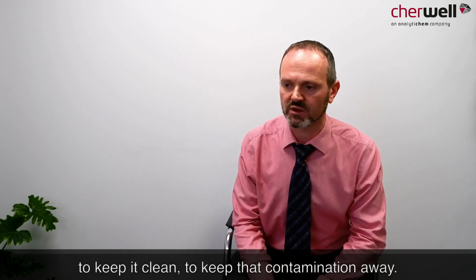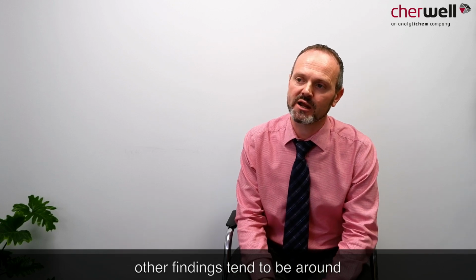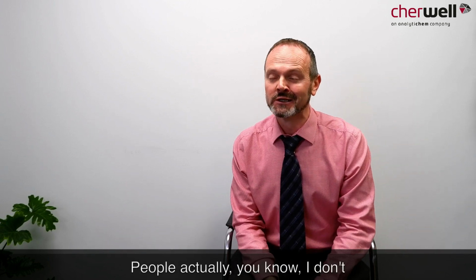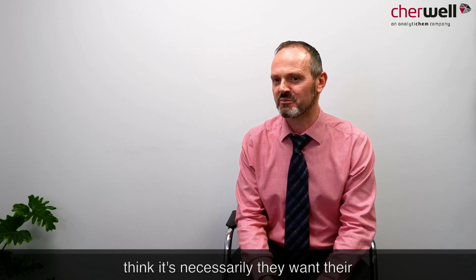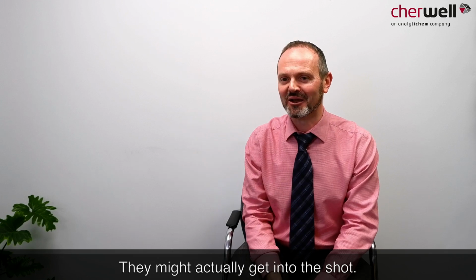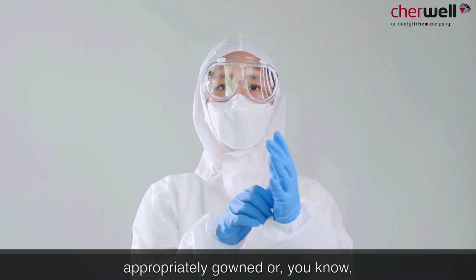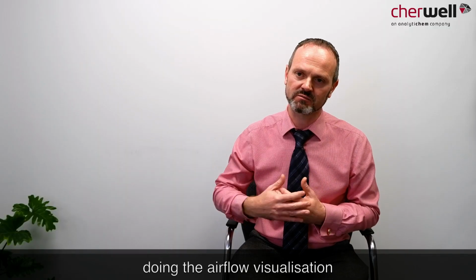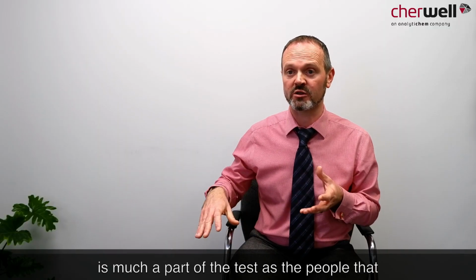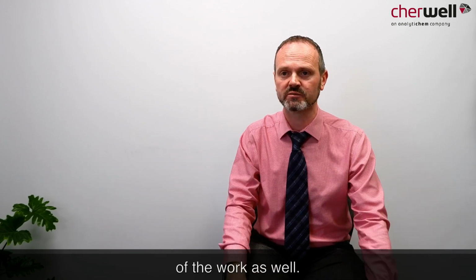to keep that contamination away. Other things I've seen, and I think other findings tend to be around cameras being obstructed. People actually, I don't think it's necessarily they want their 15 minutes of fame, but their arm might get into the shot. Also actually being appropriately gowned, or in the correct PPE for the environment that you're in. Remembering that the person doing the airflow visualization is as much a part of the test as the people that are actually in the forefront or in the foreground of the work as well.